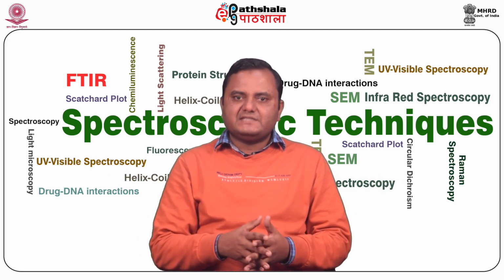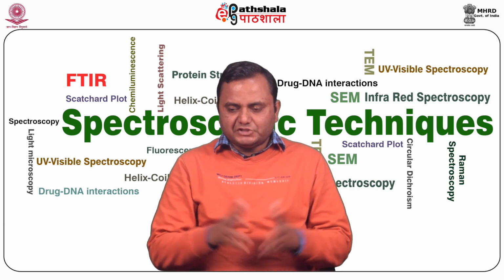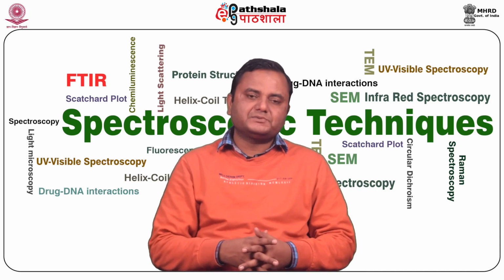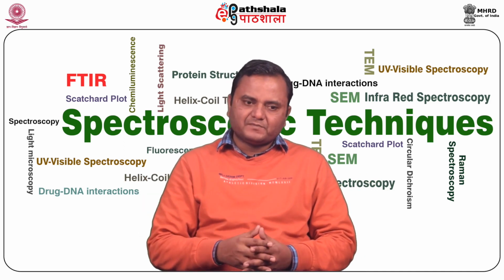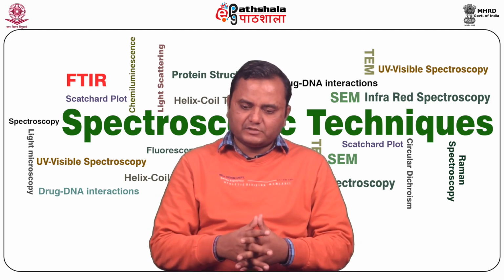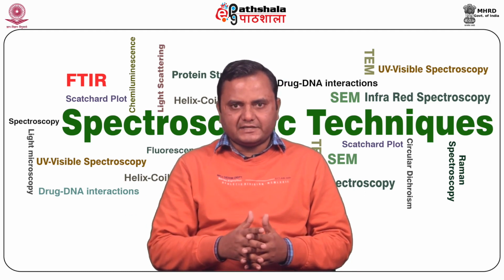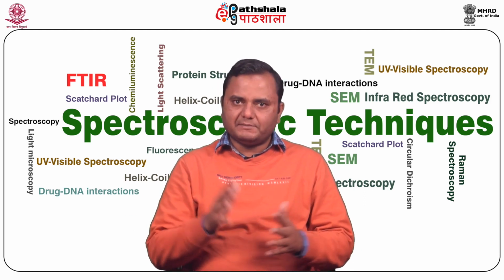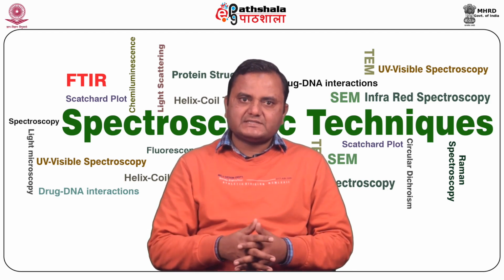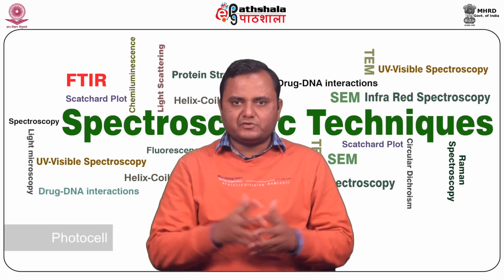And the detector is placed at 90 degrees to the excitation beam because emission takes place in all directions, as compared to absorption, which always happens in a unidirectional linear direction. However, the emission takes place in all directions. That is why, to avoid any absorption phenomena, detectors are always placed at a right angle to the excitation light. So upon excitation, the sample molecule fluoresces and emits in all directions and is detected by a photocell at a right angle to the excitation beam.